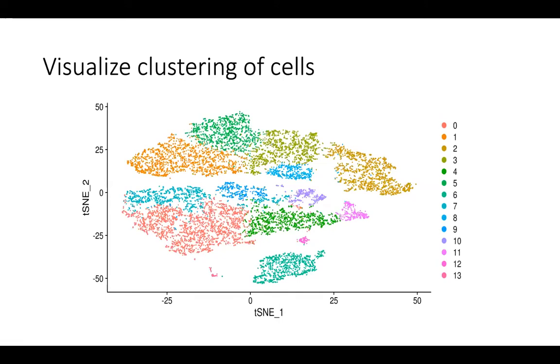So in order to be able to identify or ascertain how many potential clusters of these cells there could be, we do all of these steps beforehand. So it's not a very straightforward process, and I think a lot of customers lose track of the amount of work that goes into creating these t-SNE plots. But these t-SNE plots are somewhat meaningless, right? What do these mean?